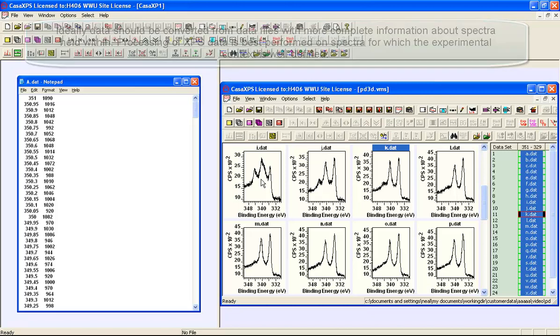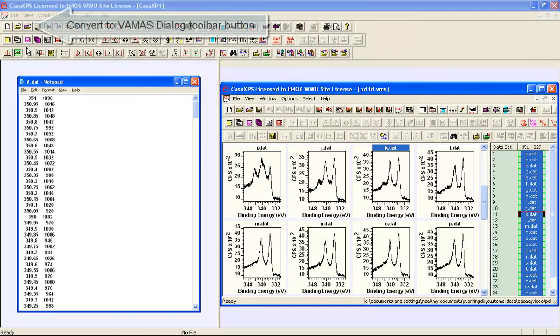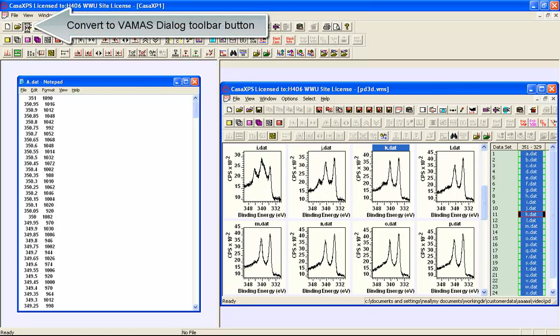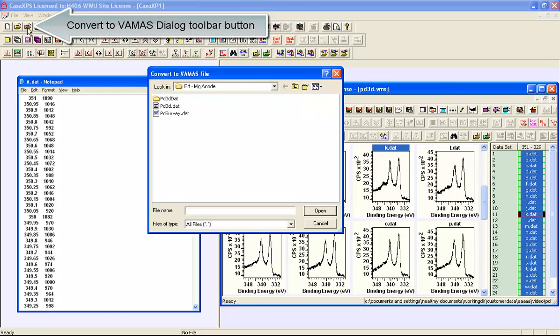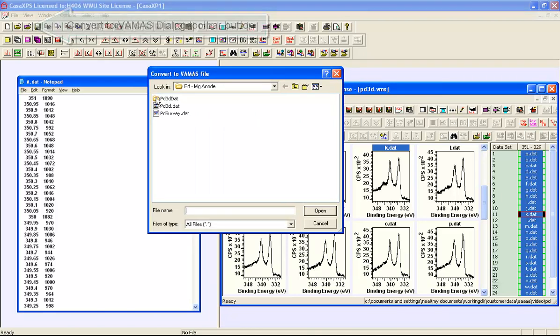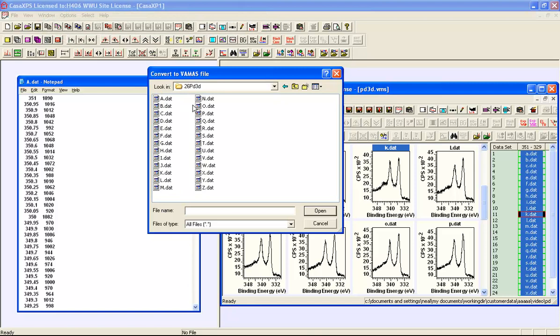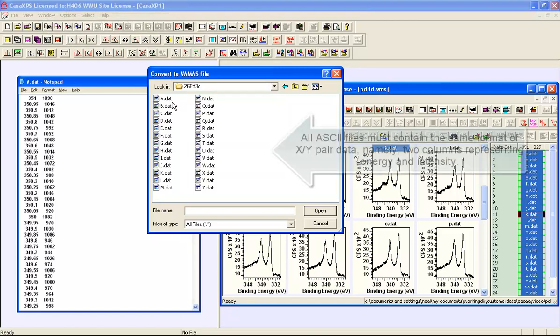To convert a directory we use an option that is convert to VAMAS file and we can then select a directory that contains the set of DAT files.